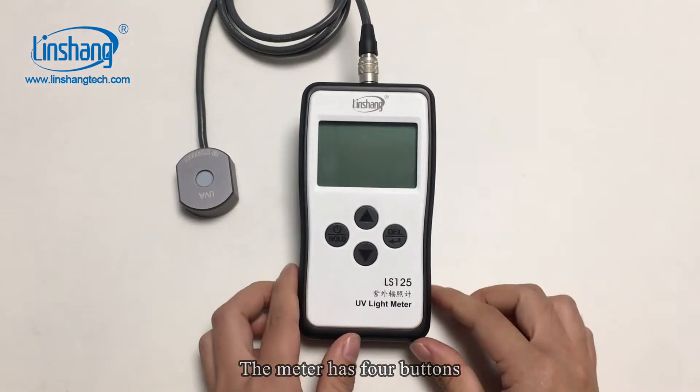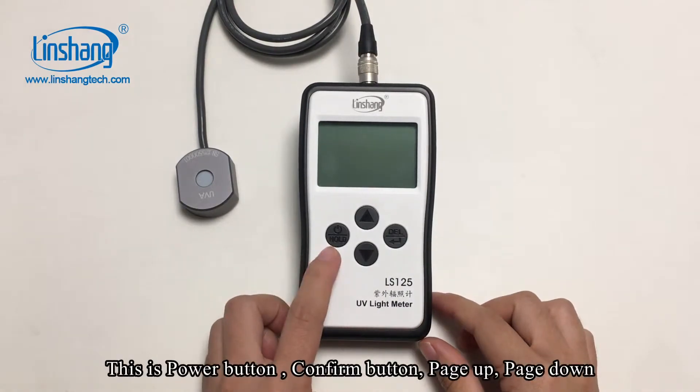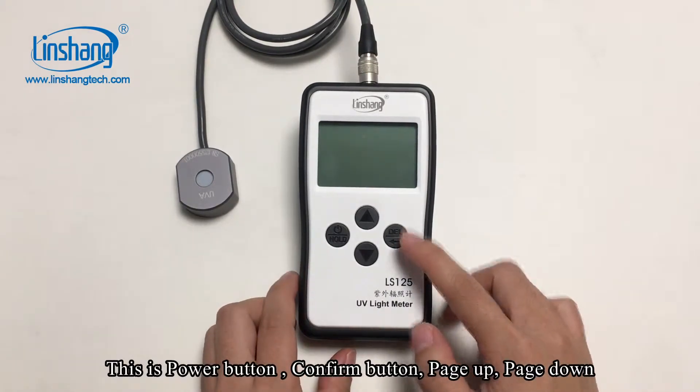The meter has four buttons: the power button, the confirm button, page up, and page down.